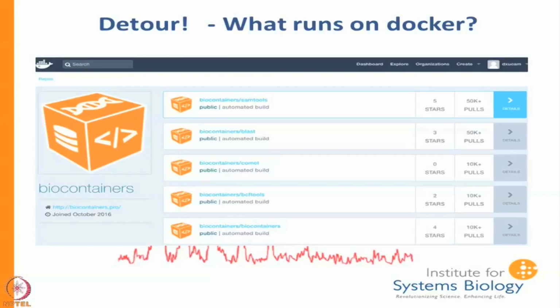There's also this thing called biocontainers, and the biocontainers folks basically maintain all these different tools. SAMtools is a big genomics tool for doing alignments, and it's one of the tools available in Galaxy. And this is an easy way. So these are basically bio software that are maintained, so you don't have to do anything. You don't have to go searching for them. You can just go to this one place and see, does it have anything that I want?